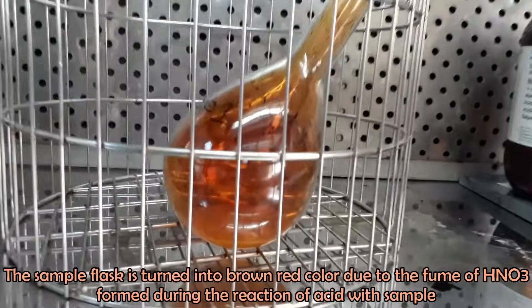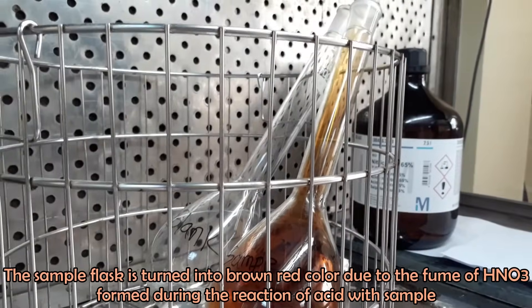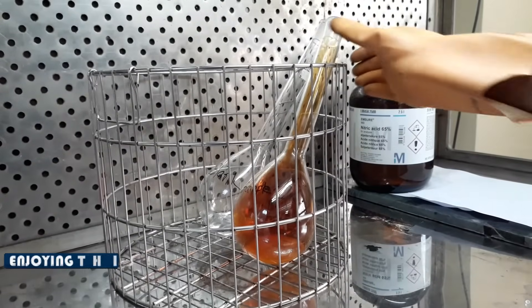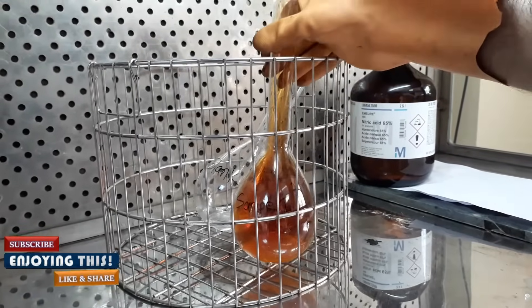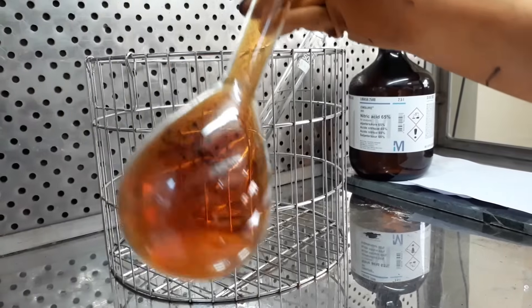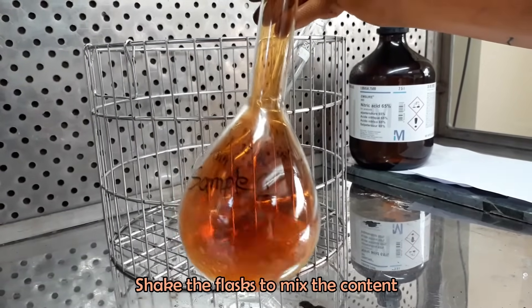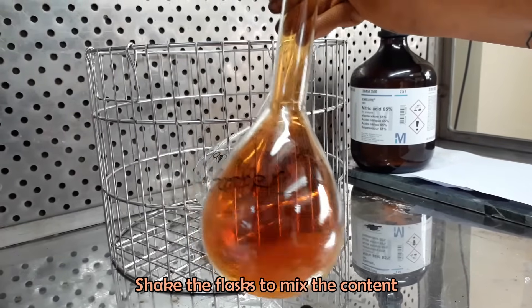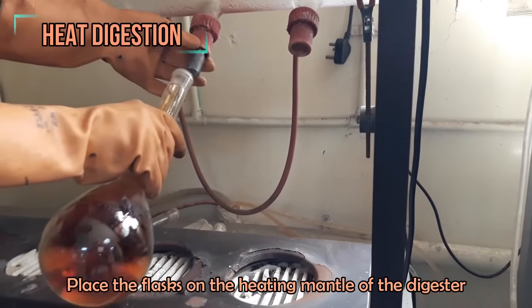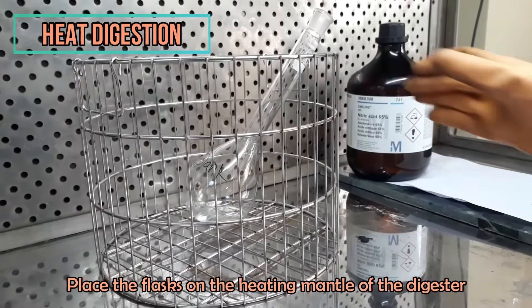After 12 hours of ambient digestion, a brown color appears in the flask containing the sample. This is because of the digestion of the sample in nitric acid.